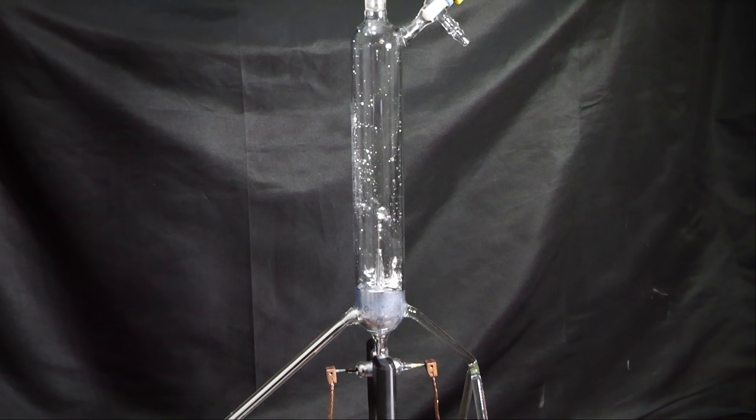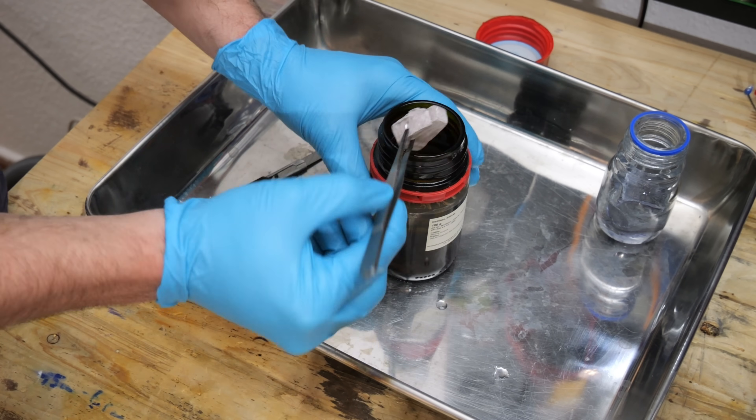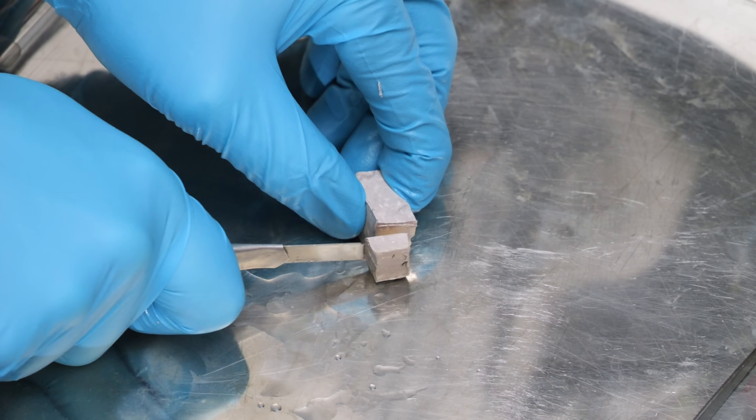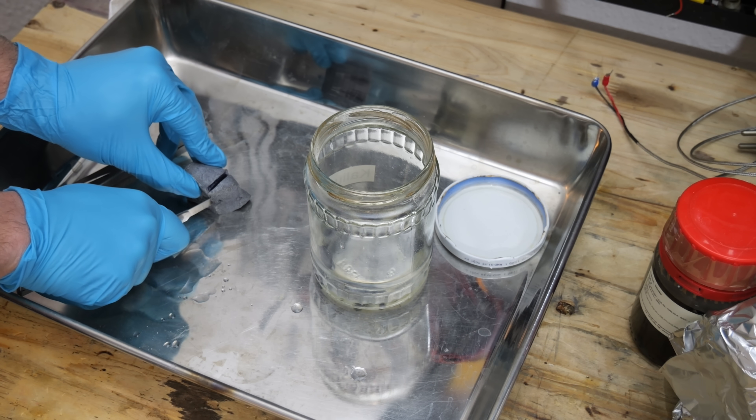In today's video I will be constructing a fountain that runs on liquid metal, but not just any metal. This is sodium, an alkali metal that's soft enough to be cut with a knife. And this here is potassium, also an alkali metal and even softer than sodium.